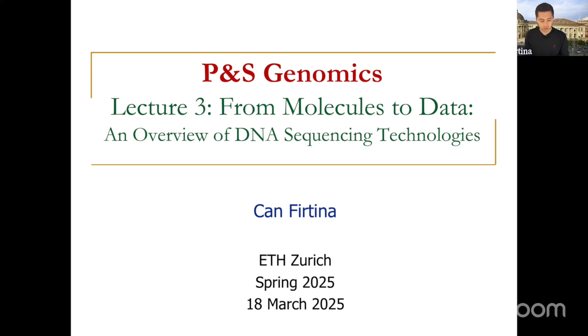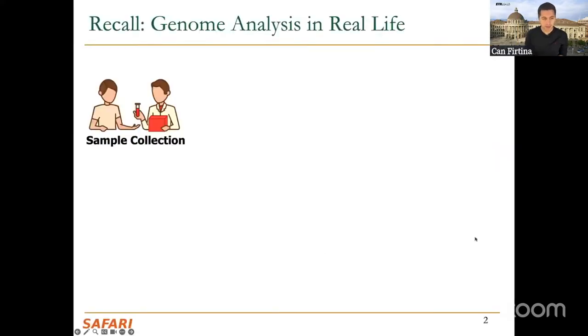Welcome everyone. Today we will cover the ways that we convert the biological molecule, DNA or RNA, to digital data so that we can analyze it. With that, I'll start with some reminder slides from the previous week. We covered some of these.